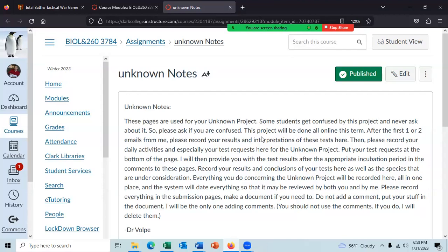And then when I send you the results, you don't have to copy my information. You could just say the color of the bacteria were pinkish. So that's the results. The observation is the results. And so my interpretation or conclusion is that it's gram-negative bacteria. And that would be your conclusion. So the results are your observations. The conclusions are your interpretations of the results.